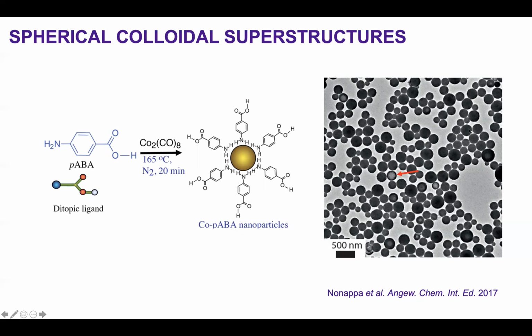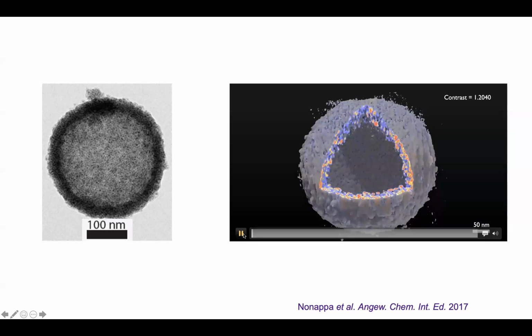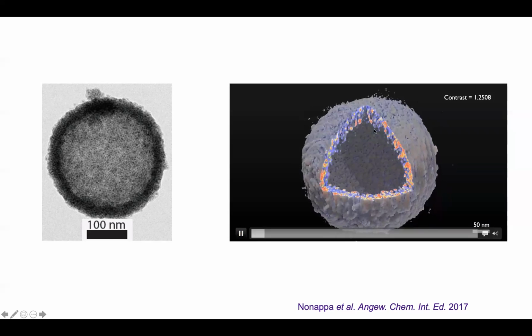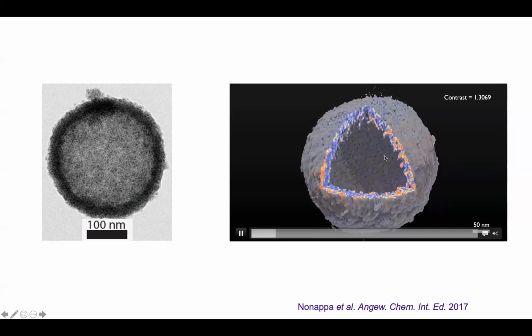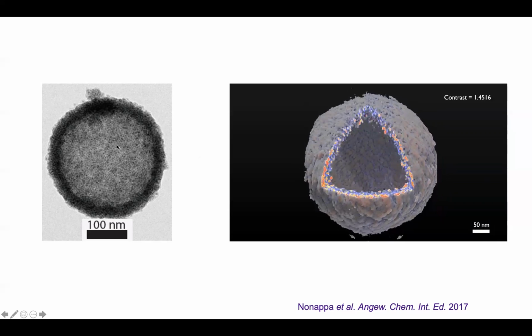If you take a low magnification, larger image, you see a lot of spherical particles of different sizes. But the difference here is that you see one which has a less contrasted core, while the others have a uniform core and shell. So it is interesting to see why we see this type of structure. If you take the TEM electron tomography of this, you start to see that it is a hollow particle where the interior is empty. That explains why this core is there.